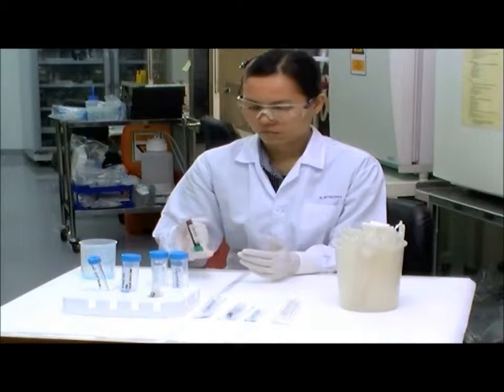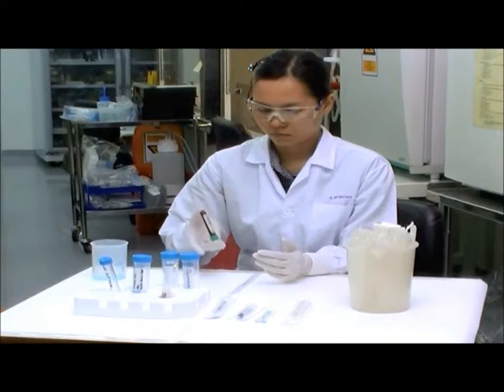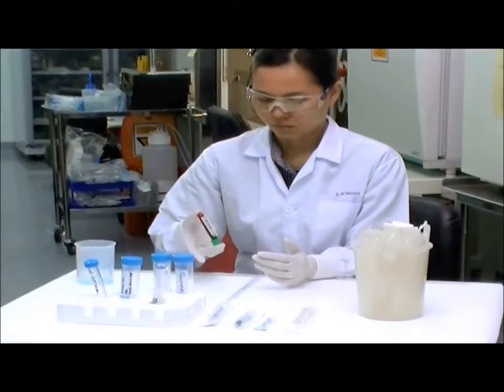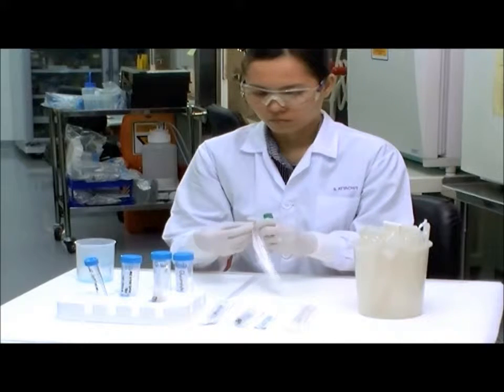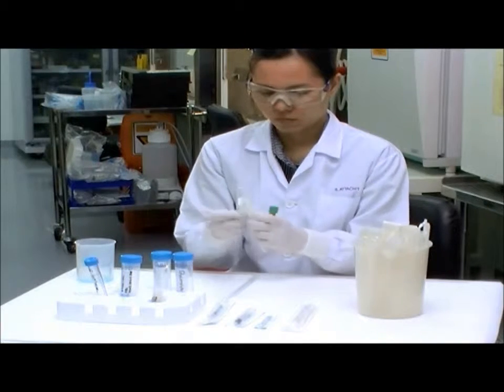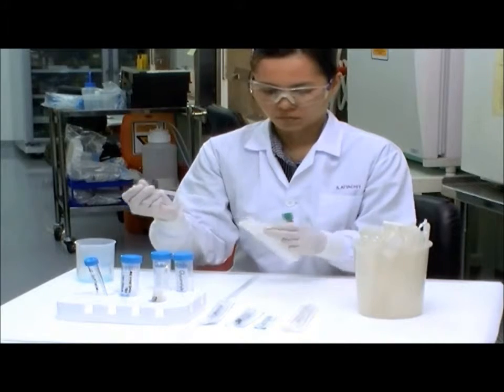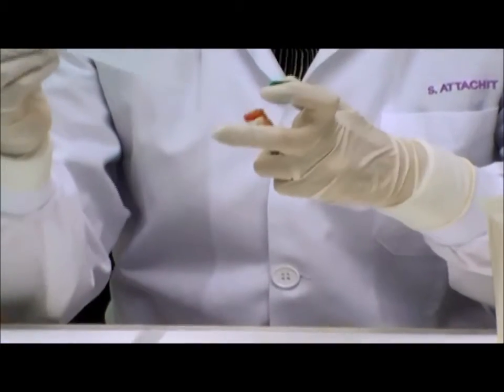To begin the procedure, mix the blood in the heparinized tube by inverting the tube a few times. Transfer the blood from the sample collection tube into a 15 ml centrifuge tube using a transfer pipette.